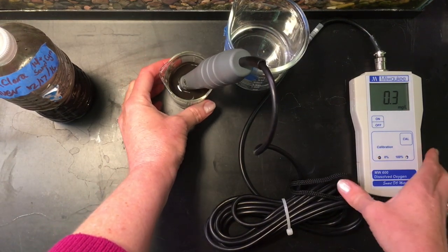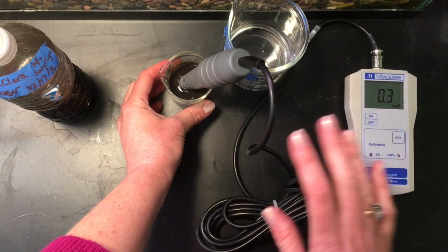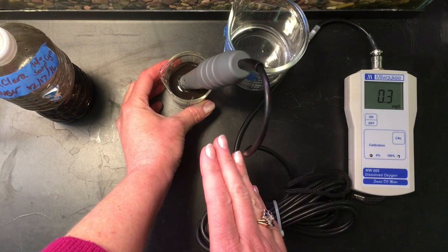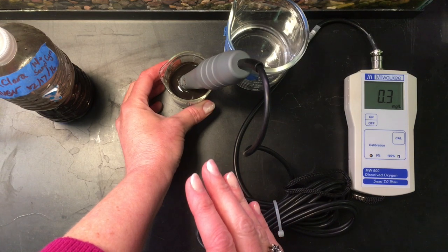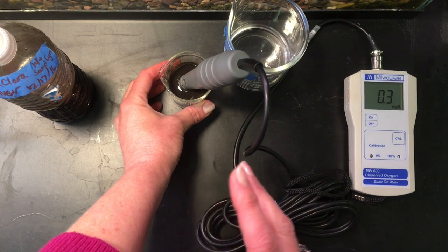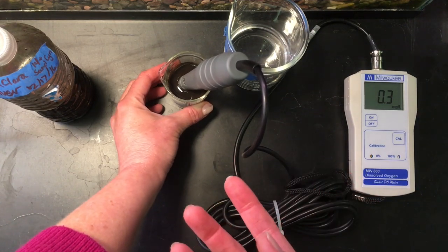After one minute, you can see that the number has stabilized at 0.3 milligrams per liter. So this is completely anoxic. This is almost zero oxygen in this water. And again, that's because there was so much debris and ash in this water from the fire.